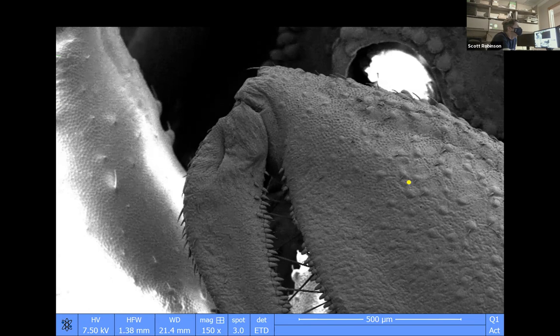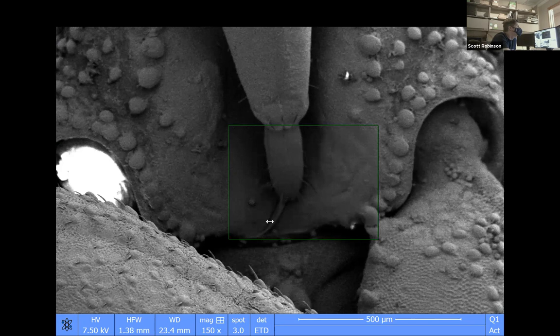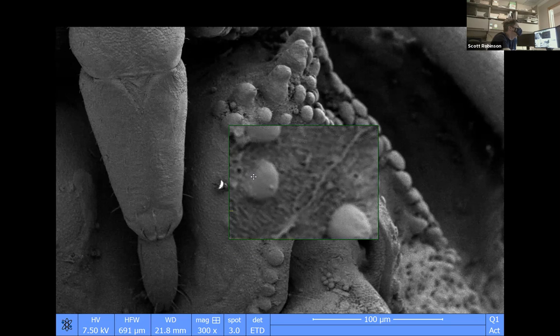So this is one of those great big forearms. And then you can see the rostrum, and that's probably pretty hard too. We had another request from Scarlett to see a caterpillar after this. We'll get back into that. Okay. So are those wart-like structures part of the cuticle, or is it covered in something? I think they're part of the cuticle. I think they're armored. I think they're just bumpy like that.